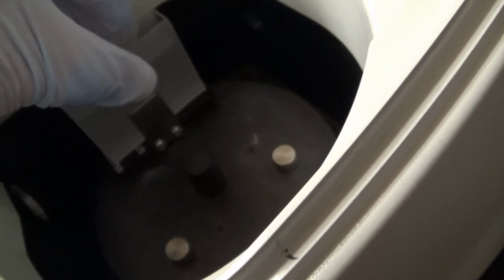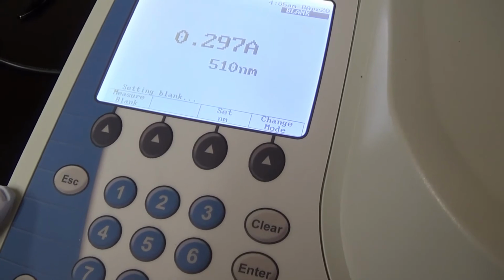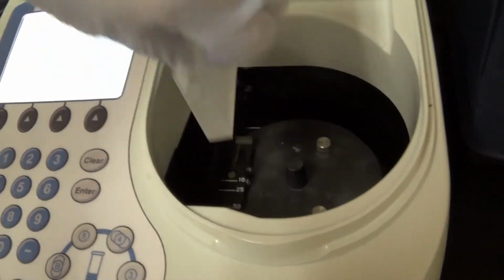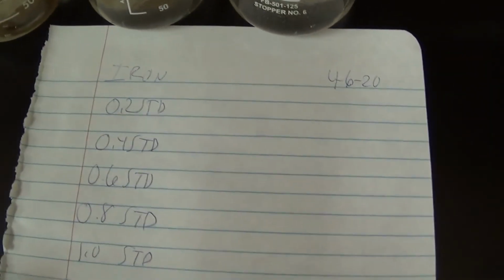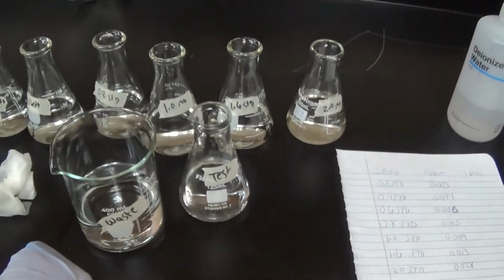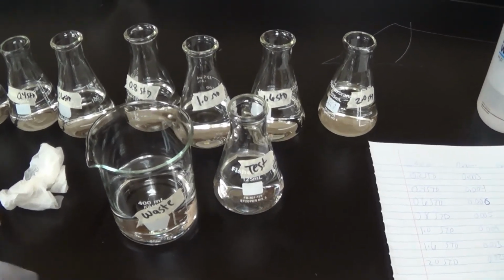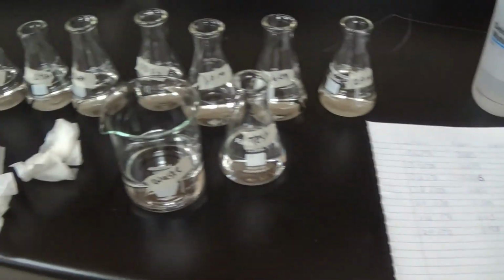Measure blank. Okay, can take that out now. Dump it out, rinse it with the DI water, and then add my 0.2 standard. And then, once I read the absorbance, write it on a list. So I am done, and these are my results, and as you can see, we did not get good color development. I checked the pH, and it's closer to 4 rather than 3, so that's probably a source of error. Maybe something with the timing of adding the reagents. But look forward to a change in procedure.